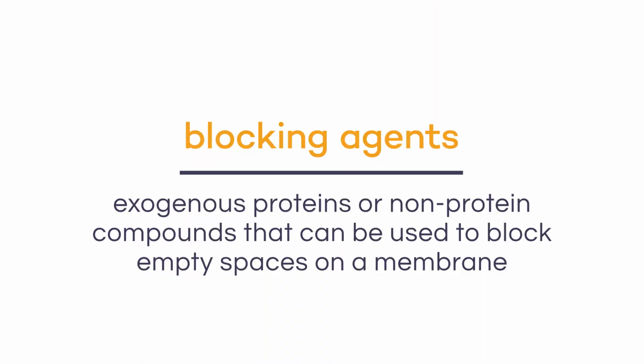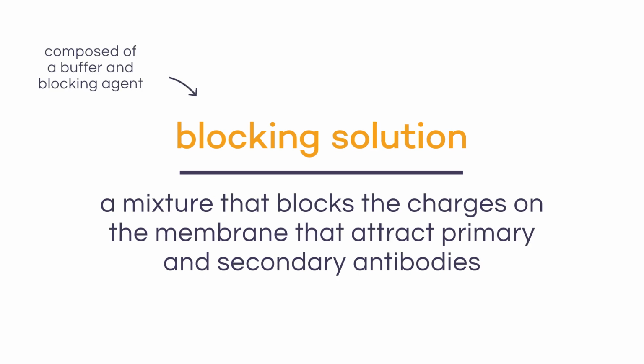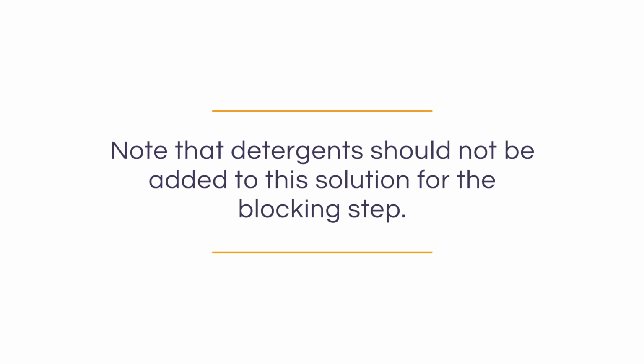In addition to the TBS or PBS base, membrane blocking solutions also contain a blocking agent, which is used to block the empty spaces on the membrane. This can be either exogenous protein or non-protein compounds in the case of protein-free blocking buffers. Blocking agents and buffers together will form a blocking solution, and this is a mixture which will block the charges on the membrane that would otherwise attract primary and secondary antibodies. Please note that detergents should not be added to the solution at this step. You will learn more about why this is from Jessica in the upcoming best practices lessons. But in our next lesson, we'll look at the options you have for choosing a blocking agent.